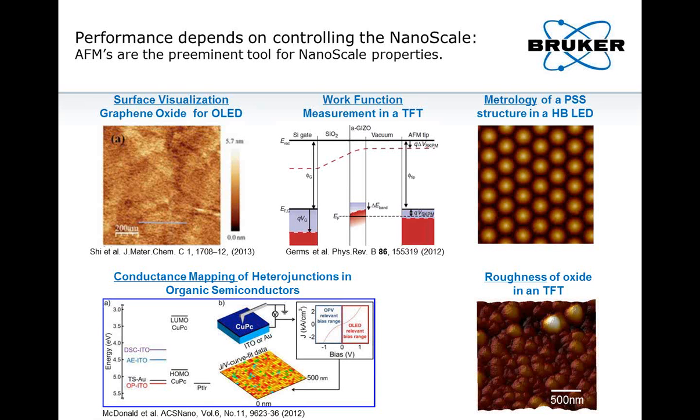And again, all these measurements are carried out with a nanometer spatial resolution, and that's what distinguishes the AFM from other tools that can do at least part of these measurements too.